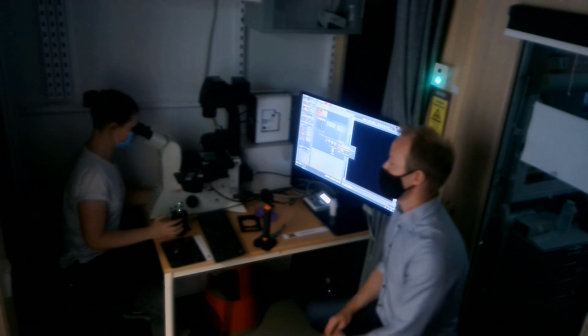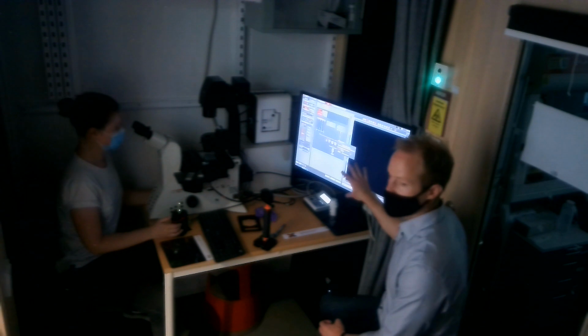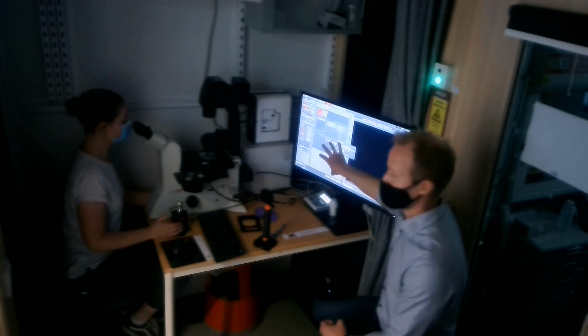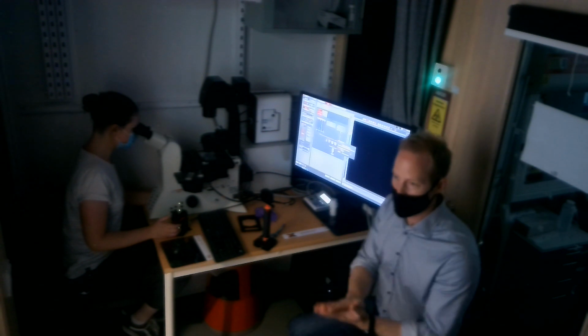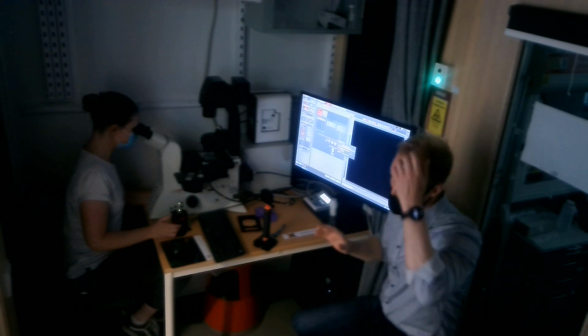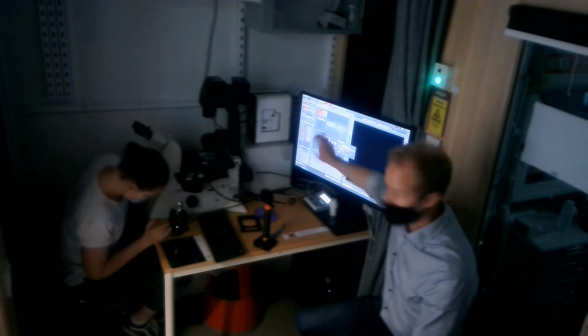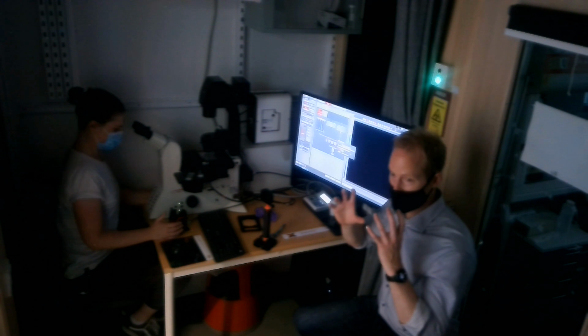So I would say in general, for most things, if you have the software on, I would control all the settings from the software. If you want to look by eyepiece, I would still use the software to say, okay, I'm looking at bright field, I'm looking at fluorescence, and I want to look at this channel and so on. I would use this just with that lever in, so that the light goes to the eyepieces.